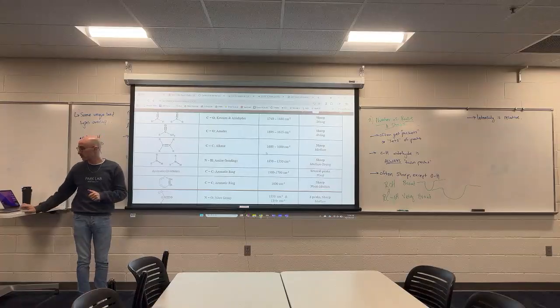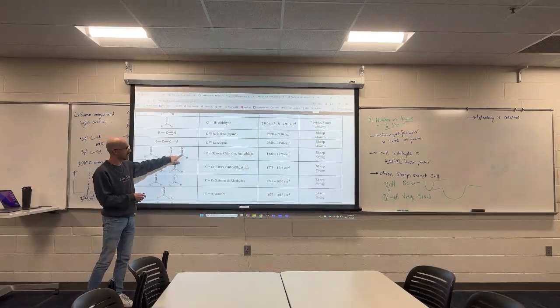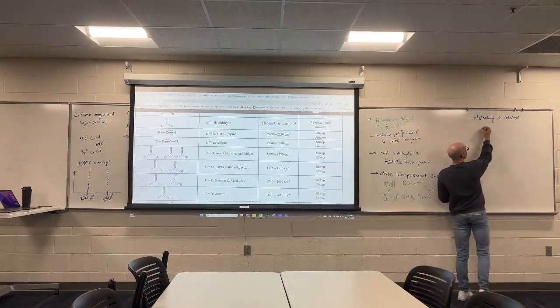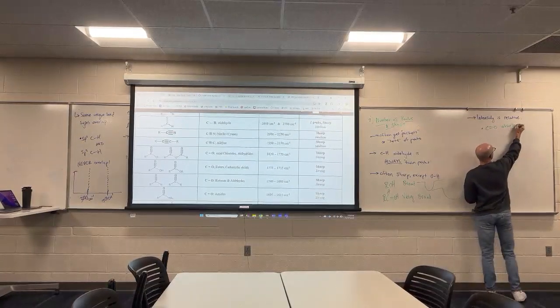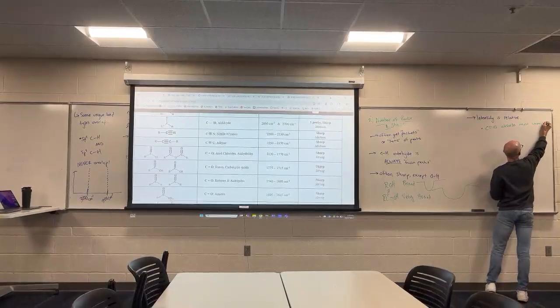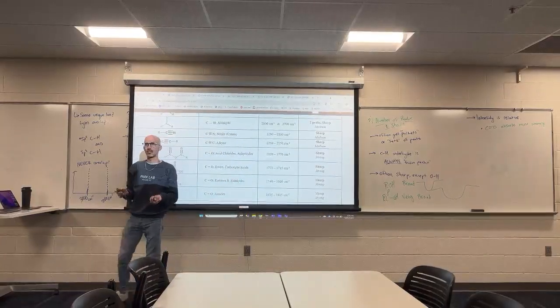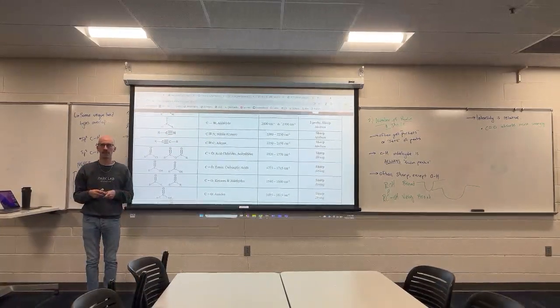Some of the bonds that absorb the strongest are the CO bonds. CO bonds are almost always the strongest bond type. They can make other strong absorbers look like medium absorbers relative to them.